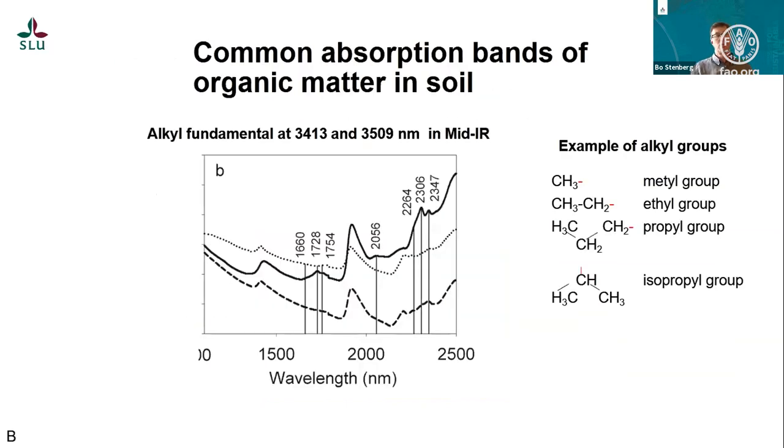Now, if we focus on the near infrared, this spectrum starts at about 1,000 nanometers in the near infrared. You can find some bands in the literature, and I have also seen them in published work. I think we'll have one of those with a paper where this is described a little bit more. But one band that you can find in the literature is 1660. I have never seen that, but maybe it's somewhere else in some other source. I've never seen any effects of organic matter there.